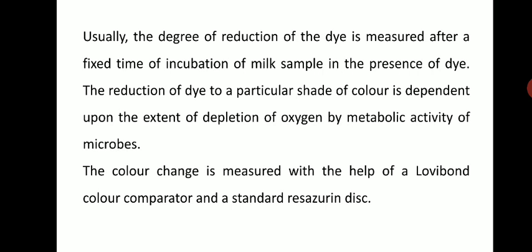Usually the degree of reduction of this dye is measured after a fixed time of incubation of the milk sample in the presence of the dye. So in this particular test we have to fix the time of incubation. The reduction of dye to a particular shade of color depends upon the extent of depletion of oxygen by metabolic activity of microbes.